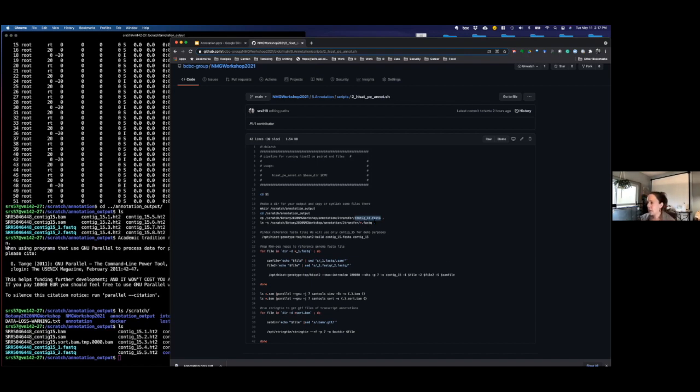And then the other thing we do is we symlink into that directory. So this is a symbolic link to FASTQ files. Symlinks are just nice because you're not making a redundant copy of the data, which would take up disk space, but it does kind of make a placeholder for that thing. For all intents and purposes, it looks like these FASTQ files are in our working directory, but they actually live somewhere else and it's just a pointer to where they are. So it just saves disk space, which is nice with this type of stuff because oftentimes you'll end up with enormous files.